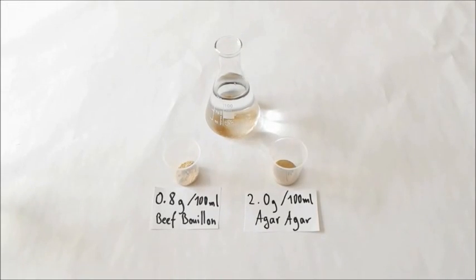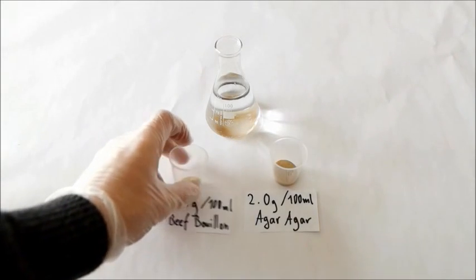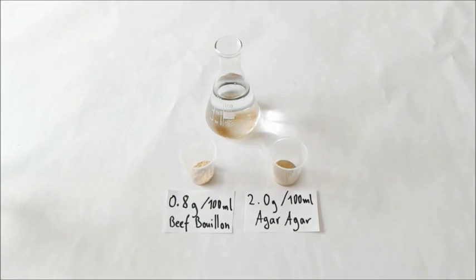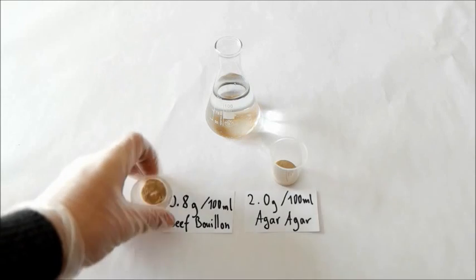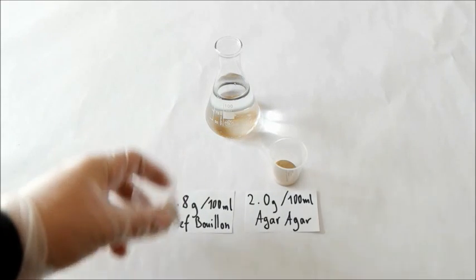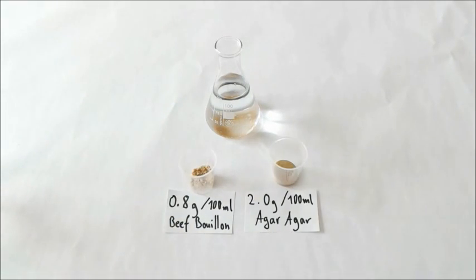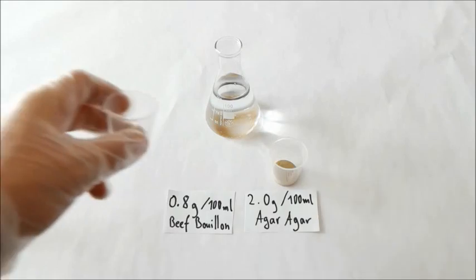A good thing is that this beef bouillon instant soup already has enough minerals and sugar for the bacteria. So you don't have to add any sodium chloride or glucose to your solution.